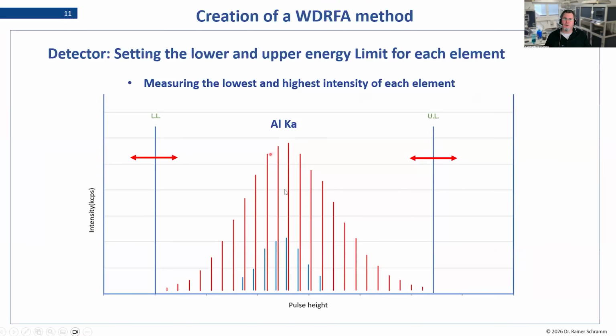What we always try doing is using the highest intensity of our samples and the lowest one, putting them together and making sure that the signal peak, which is a line diagram, is captured well within our two limits. And if not, we optimize. But in my experience, 95% of all the line libraries out there already have very good settings, because the technical standard of these machines is quite high.